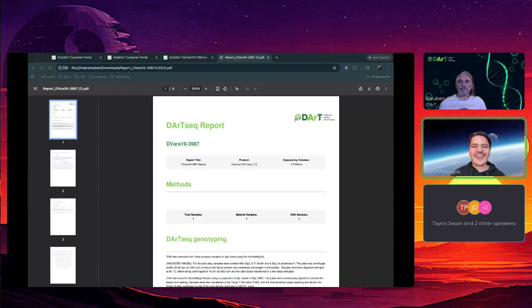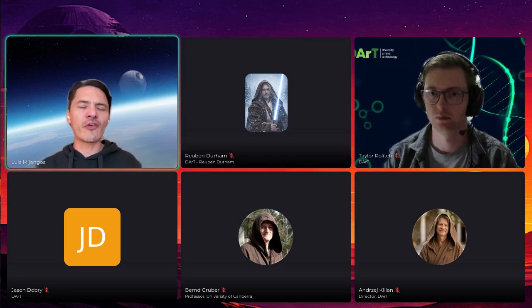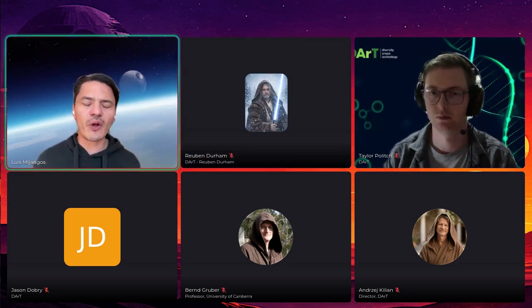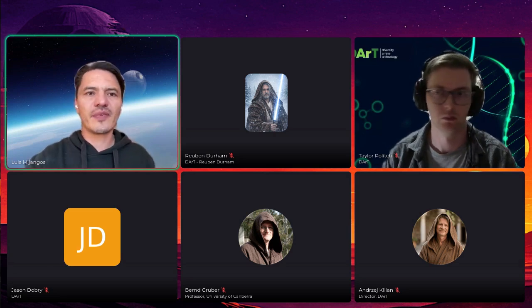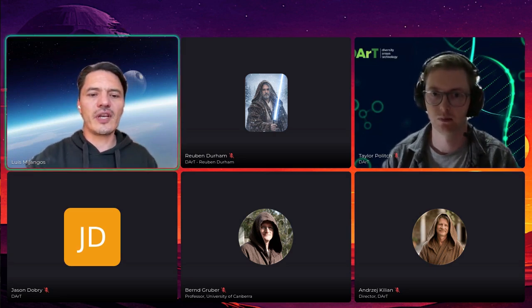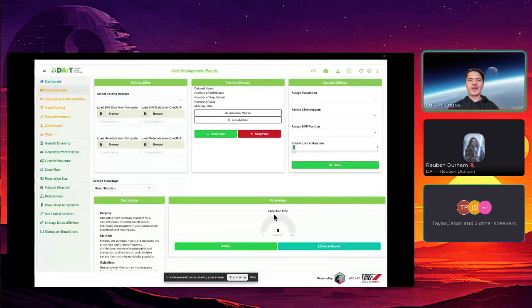Thank you, Ruben. Very nice. Yeah, so the Reporter app is an awesome application that lets you customize in thousands of ways any report. We also have access to this Reporter app in dartR that I'll show you very quickly. So I'm going to share my screen. Okay, so here we are again in the dartR implementation in the OneDART platform.